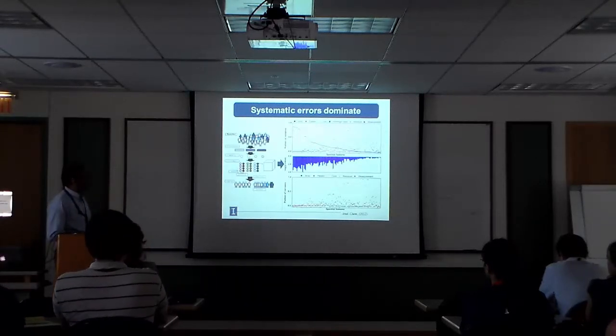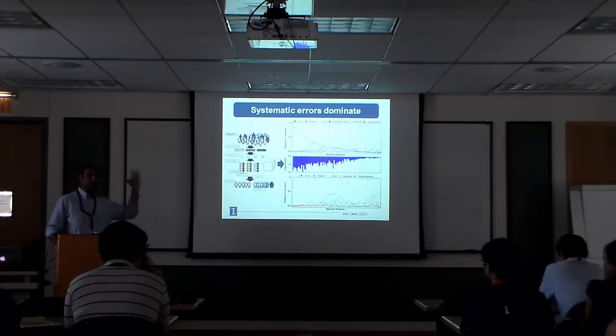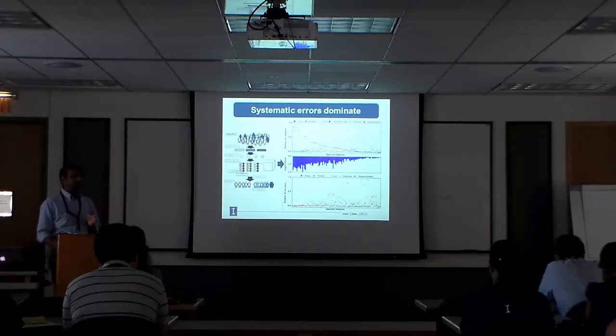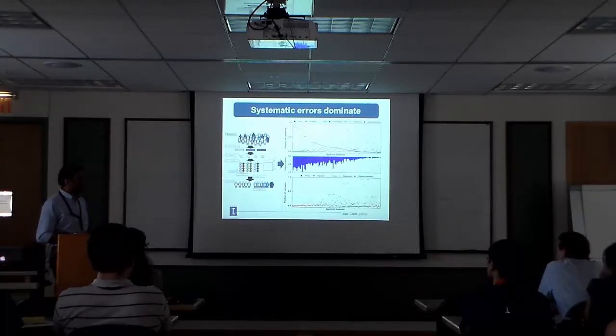It turns out, quite surprisingly, we were a little bit surprised that we ended up with about 30 frequencies from this. So okay, from this 2,000 feature set you can build multiple features and all that. It turns out only 30 were informative, right? And then we went back and looked at the old data, and when we did our prostate algorithms, it turned out we got only 17 that were informative, right? After that, we pretty much found no more benefit to doing those kinds of things. So this number of 15 to 20 features is quite interesting, right? Because it tells you that perhaps there's a fundamental limit why people cannot go beyond a certain point.